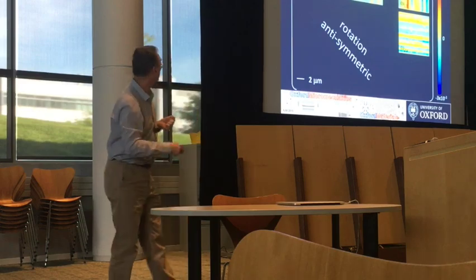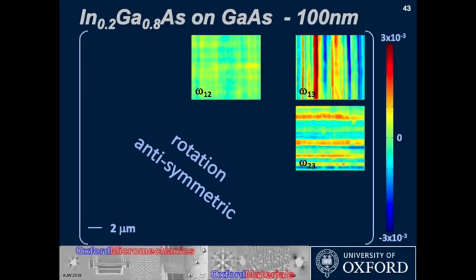Again, you see similar things in the rotation fields. So again, this is a rotation around the vertical axis in here, and you can see those edge dislocations causing that rotation for that sense. Similarly for this sense. This is all driven by screw dislocations, much weaker because the screw dislocations, you tend to get some pairing of the sense of those to take out the long range.